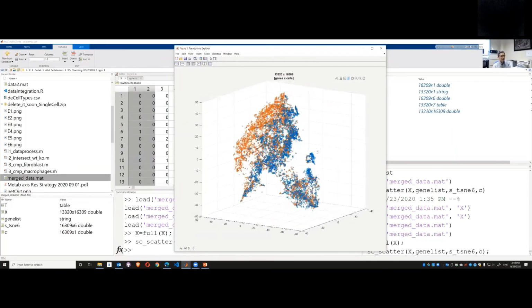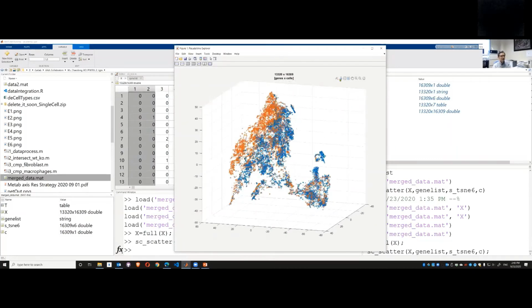If you see, there's a small group here. This small group of cells looks different from all other cells. They form a small cluster on their own. Then this application will search the database based on their gene expression, so-called marker genes expression, to tell you, okay, this is called a mast cell.